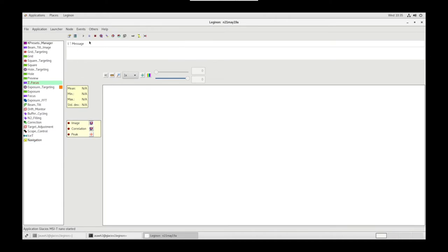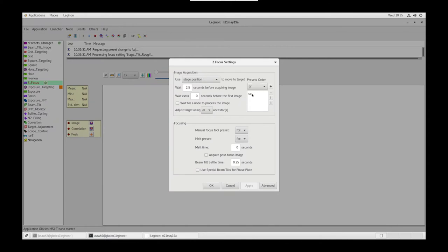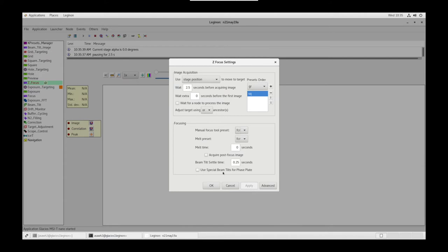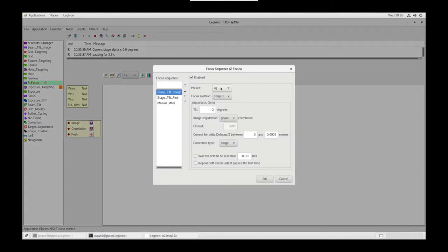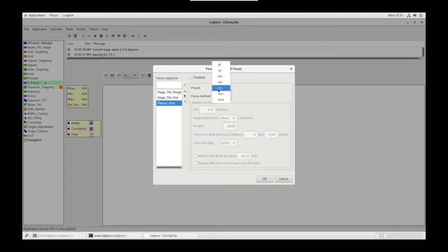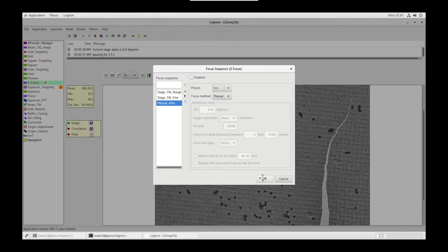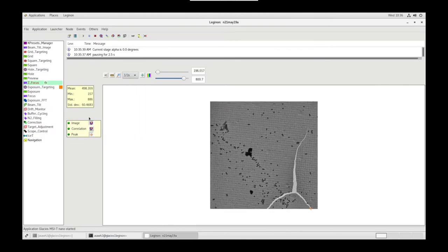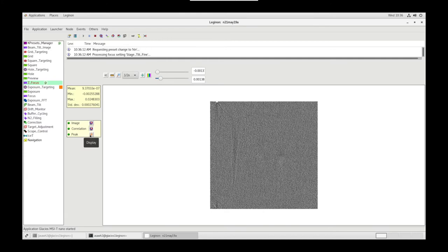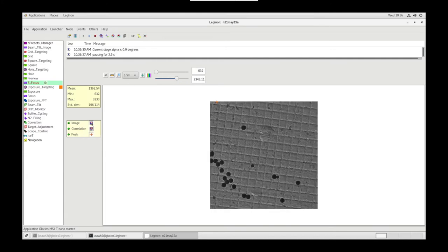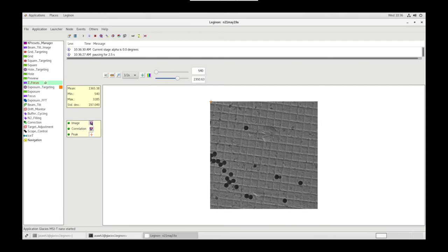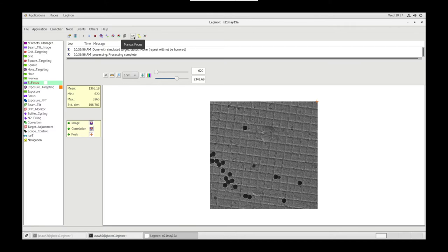On the Legenon PC, let's go to the Z Focus node and simulate a target. Let's double check our settings. Make sure that the Preset Order says Square and Manual Focus Preset is FCN. In the Focus Sequence settings, let's make sure Rough is set to Square and Fine is set to HLN, Hole. And Manual After is FCN. We can use Peak and Correlation to make sure that we see a peak in the corner of the image. This ensures that we are indeed finding eucentric Z focus, or eucentric height.